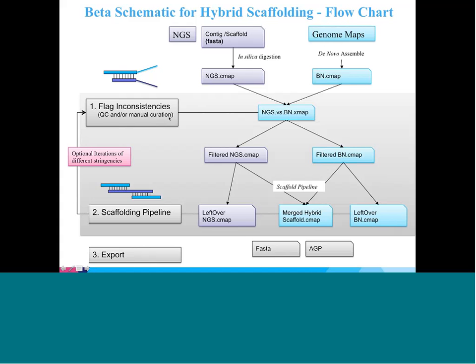We just set a hard cutoff, more or less, which was if there were greater than 10, I believe, unaligned sites, we considered it to be inconsistent. If it was the top alignment, basically an unambiguous alignment, with more than 10 inconsistent sites, that was eliminated from analysis. So it's a pretty conservative approach, but we believe that this leads to fewer misassemblies, which is why we went to it in our initial pass.